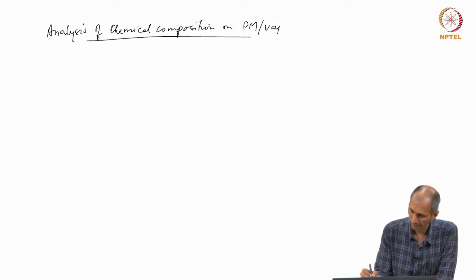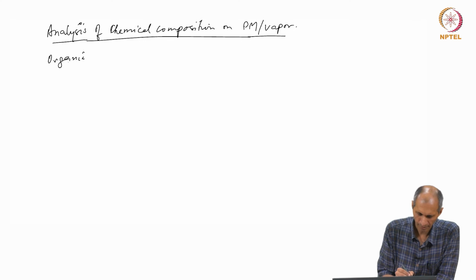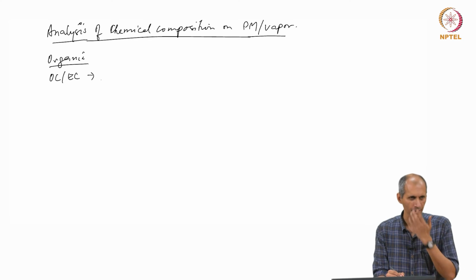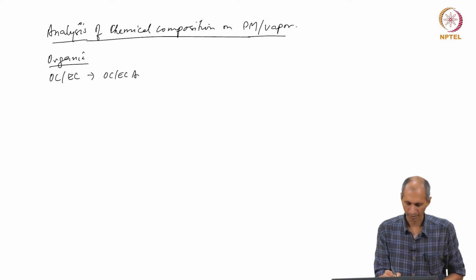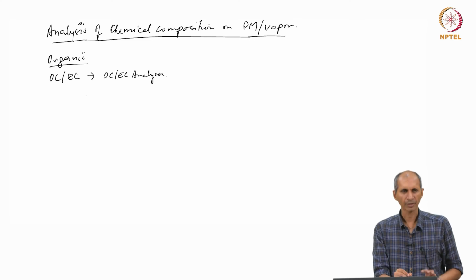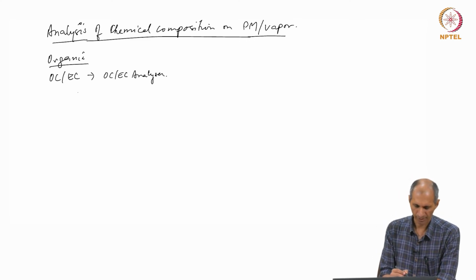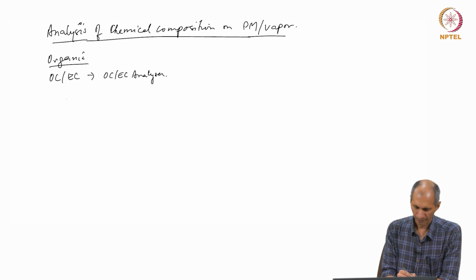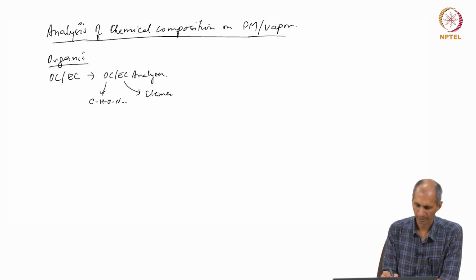PM and vapor. So, the organic analysis, let us just summarize it, is we have something called OCEC, organic carbon, elemental carbon. This is done using an instrument which is called the OCEC analyzer. What they do here is similar to the GC for one section of this. As I mentioned earlier, the OC component is all organic compounds which have some structure, some CHON. The EC component is what is called elemental carbon.